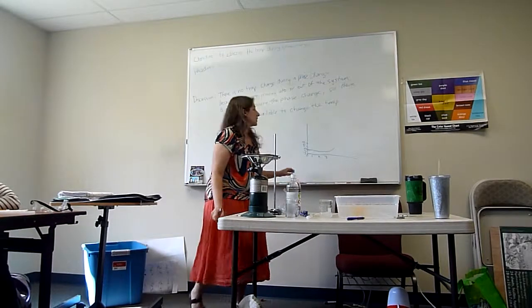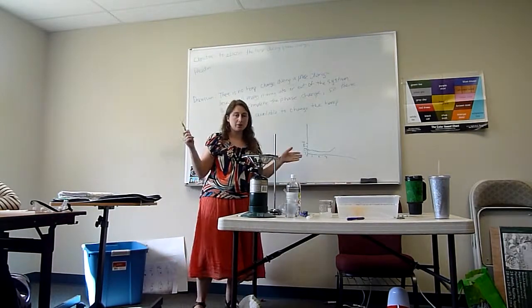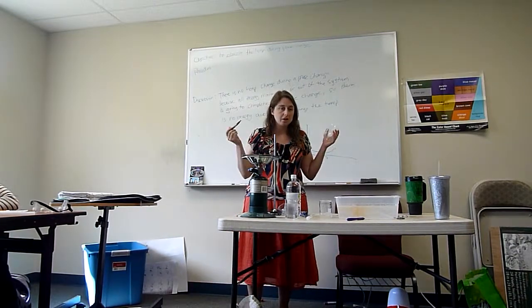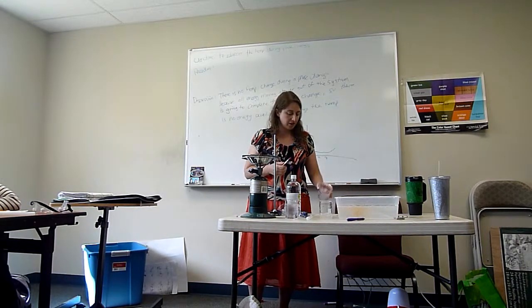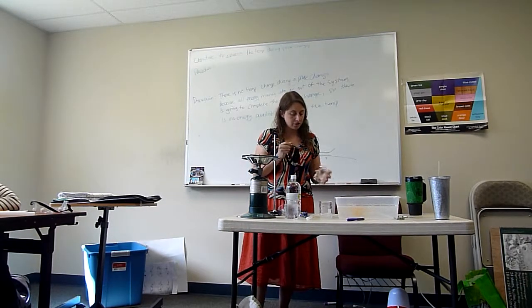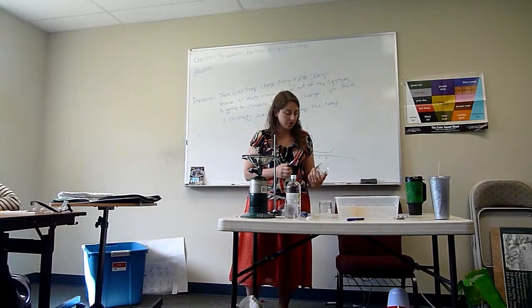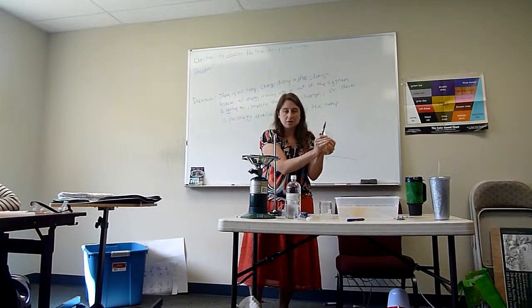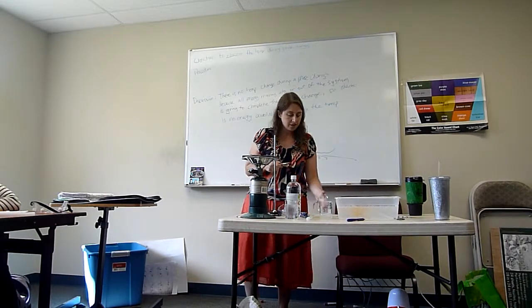Okay, so we just observed ice melting. We took the temperature of the ice every 30 seconds. And we observed that essentially during the phase change, ice melting into a liquid, solid to liquid, we did not see a temperature change associated with it. Even if we added heat with our hands to the beaker, we still did not see the temperature really changing a lot.